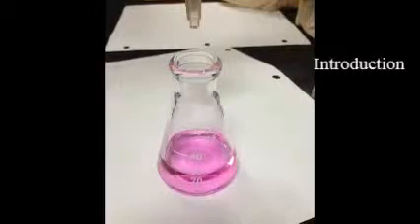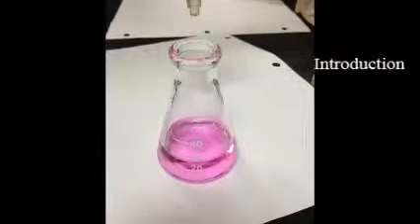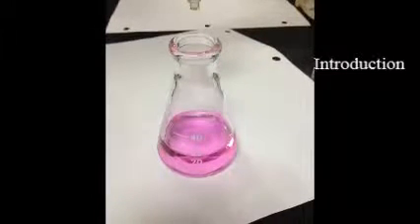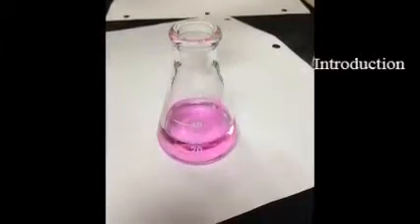This lab was performed through a process called acid-base titration in order to determine the endpoint that indicates the neutralization point. In order for that to happen, the same amount of acid and base need to mix together in order to make a neutralized solution.